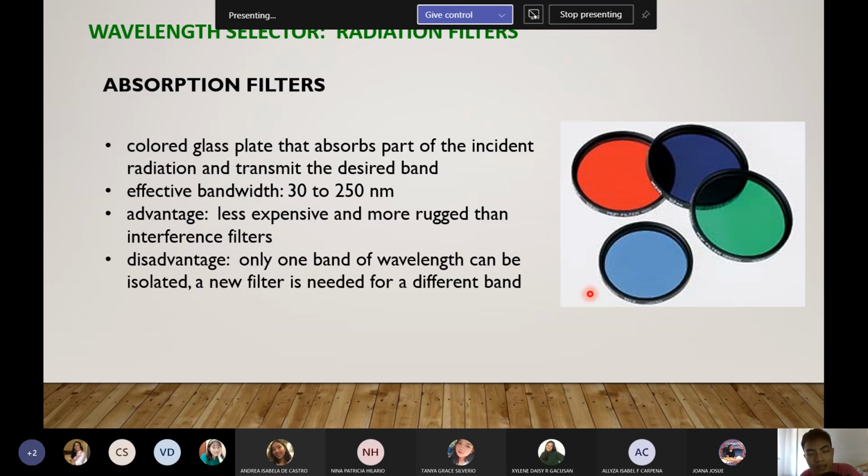Okay. Saan nyo ba ginagamit yan? Sa inyong nakikita ko sa mga post nyo? Yung pag nag-staining kayo, 'di ba, minsan kailangan niyo ng filter. Ganun din sa spectrometers, no. Kasi again, yung light masyado siyang broad, okay, pwedeng maghalo-halo yung colors doon. So if you want to minimize the mixing of light, you use filters, other than the wavelength selector.